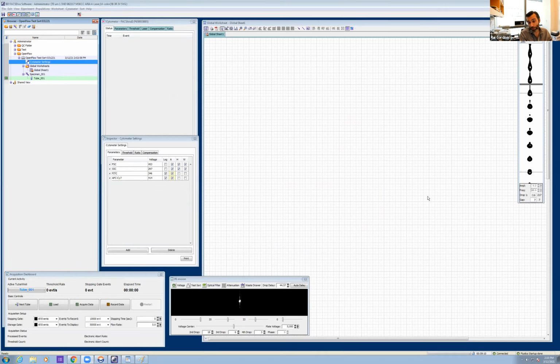What makes a purity sort longer, if you want a certain number of cells at the end, is that there are more aborts, right? If there are more aborts, the efficiency is lower, and so you need a longer time to sort the same number of cells than if you were doing a yield sort. But it's more because of that. The decision itself is being made anyway.